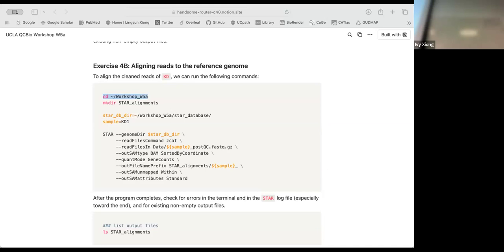Now you're in the home folder. Go into the workshop folder and list the files in there. There's a data folder, but there's a data folder within the data folder, which is not good. So remove the extra folder, and then we try again by creating a data folder.